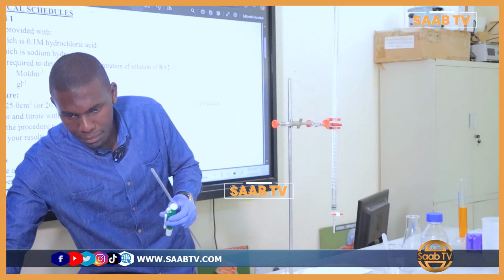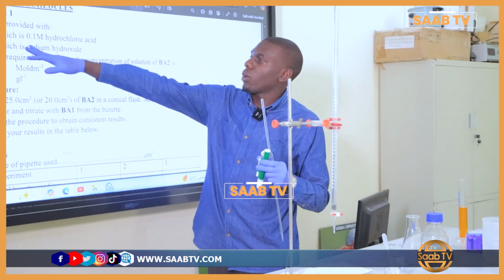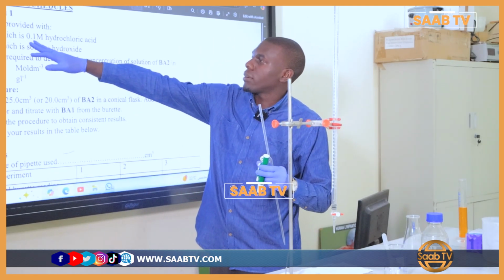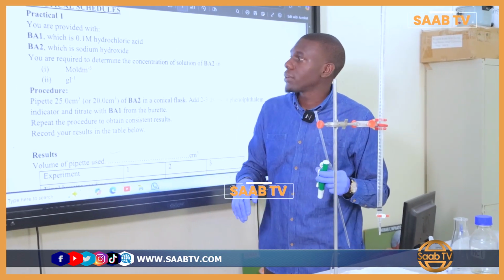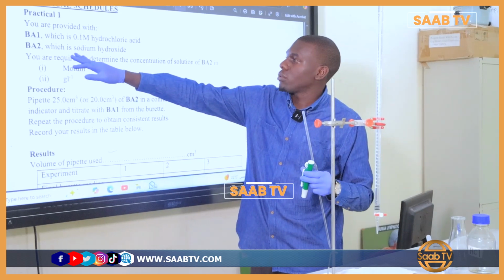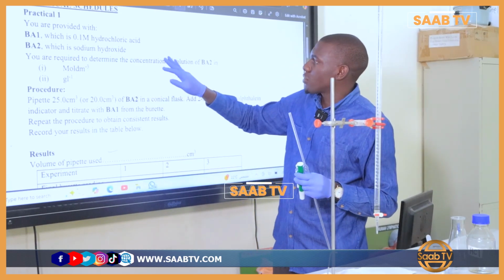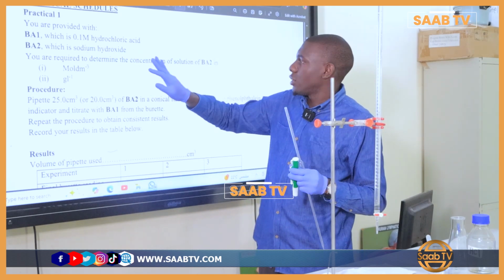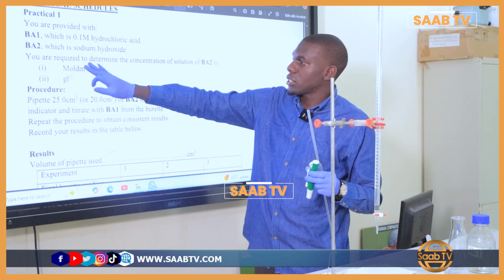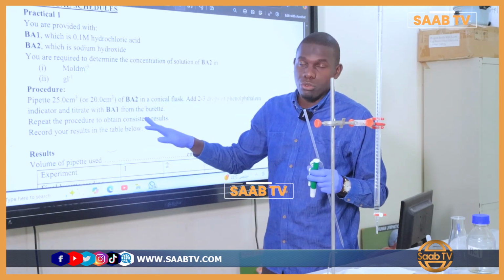The question is here. You are provided with a solution of BA1, which is 0.1 molar hydrochloric acid. Now the molar means concentration, okay? Then you are given BA2, which is sodium hydroxide solution. So you are required to determine the concentration of BA2. BA2 is sodium hydroxide solution. You will get the concentration in moles per decimeter cubed and also grams per decimeter cubed. So this is the procedure we are going to follow.